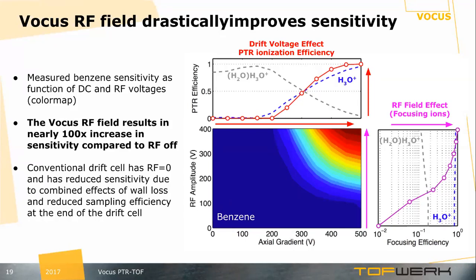Next question has to do with formaldehyde, in particular, is there any experience measuring formaldehyde with this instrument yet? Yeah, so formaldehyde is quite tricky with PTR-MS in general. In our instrument, we have quite a lot of absolute water. From the way we generate our ions, we have a high absolute amount of water, and formaldehyde can do backwards reactions when you have high water vapor concentrations.